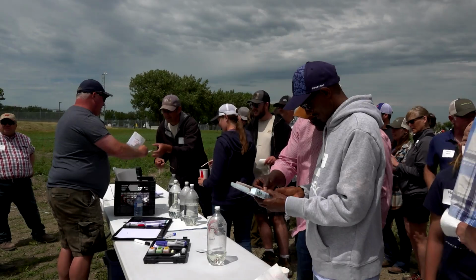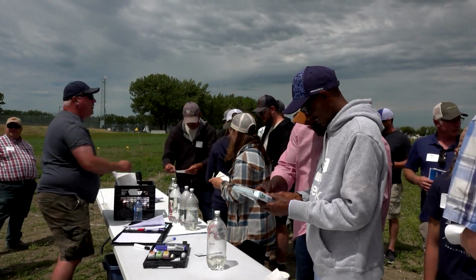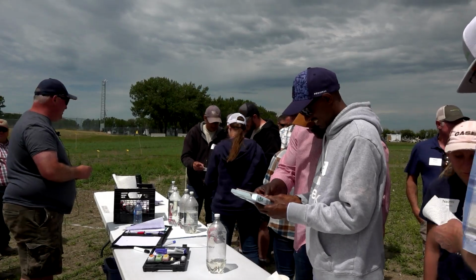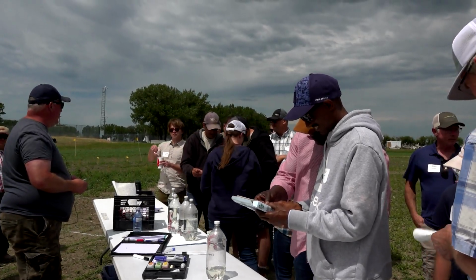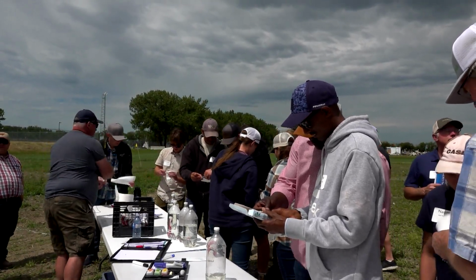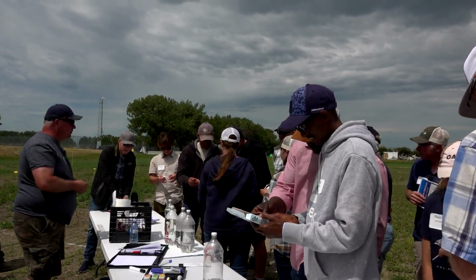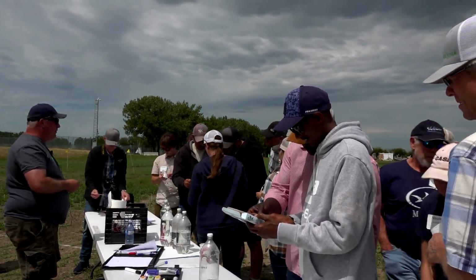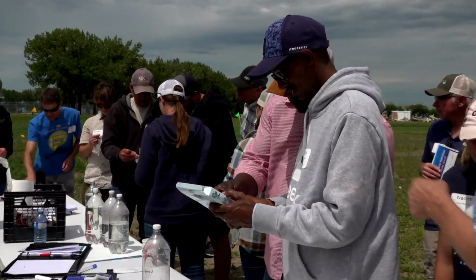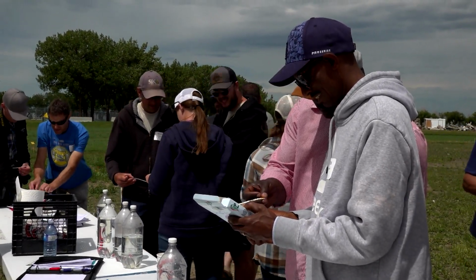Okay, basically, you're going to slide it and match it up. Try to write down and take note of a couple of those things like hardness, and we'll be able to tell you what it actually is. 2 seconds, wipe off the excess. And then there's a chart here that you have to compare. The whole thing needs to be in for 2 seconds. And then wipe it off.